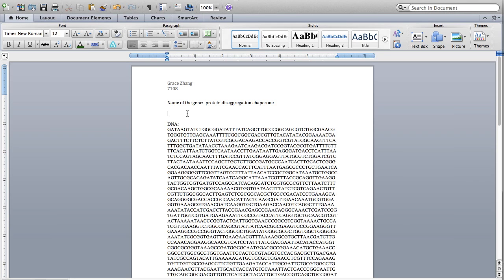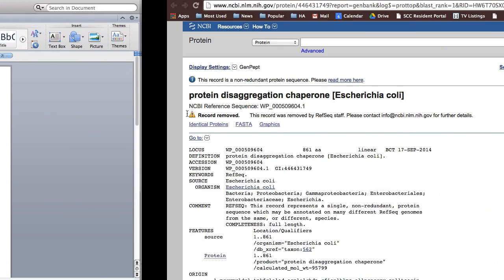So this particular BLAST did give us the species of our organism, but we do want a little bit more specific information, so we're going to do another BLAST search. For other BLASTs, sometimes it gives you a non-specific species, like multi-species. This is especially when you want to do the next BLAST, which is a nucleotide BLAST, in order to pinpoint which species it's actually from.